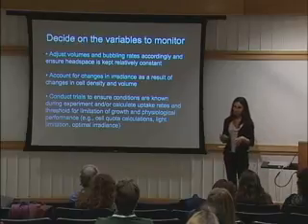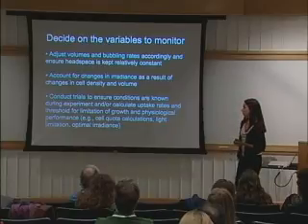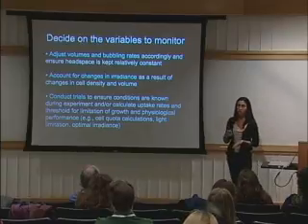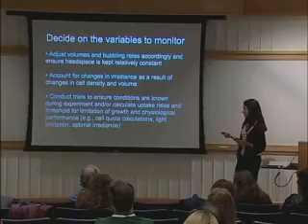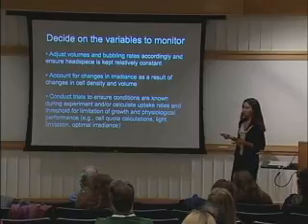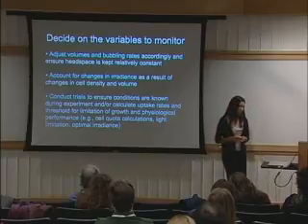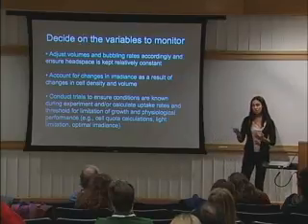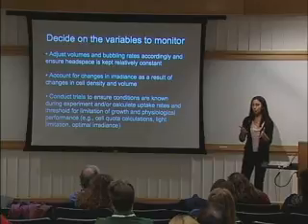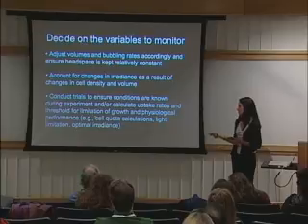As cultures grow to higher cell densities, you could potentially have light limitation. If you work with dilute cultures, that's usually not a problem, but you need to measure that and be aware of that. The best thing you can do is to conduct trials to know the state of your cultures based on the cell densities, and you can calculate uptake rates and the threshold limits that your cells can do well under and not so well under. And then cell quota calculations are quite useful.